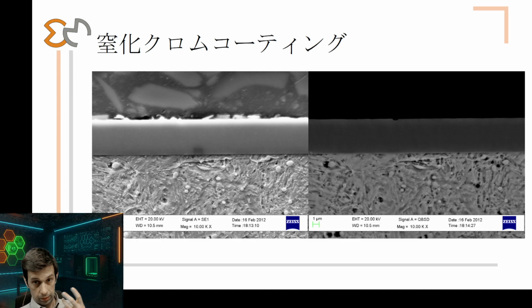They are black because carbon, which is light, looks dark, like on the top, right? So we have in the left the topography, and in the right we have an idea of how heavy an element is. It gives you the distribution of elements, more or less, if we know what we are looking at.